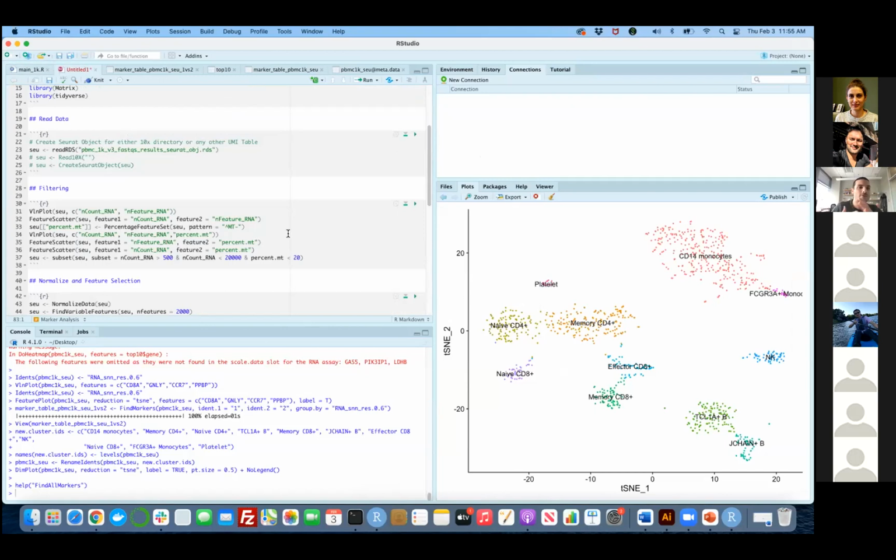Let's say that you have written some paper and you want to distribute the order of all the functions that you have used, which is really important, because if you write a paper where a Seurat pipeline or Seurat package was being used, they are probably going to ask you which functions you have used. So basically you can use this Dolphin pipeline to reproduce and distribute the functions and the order that you have used, with comments, which will be transformed into an HTML format.